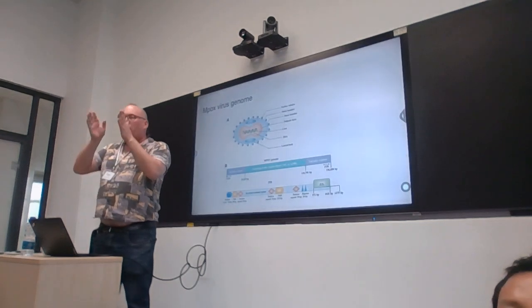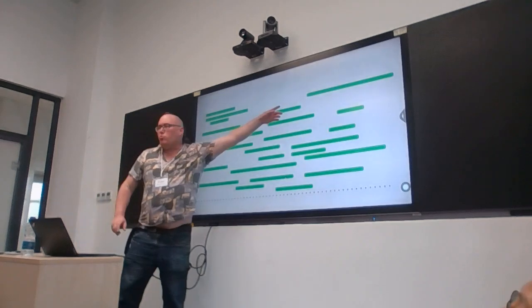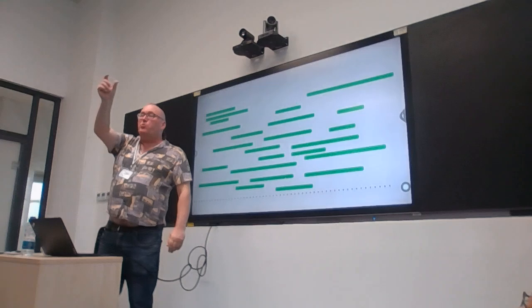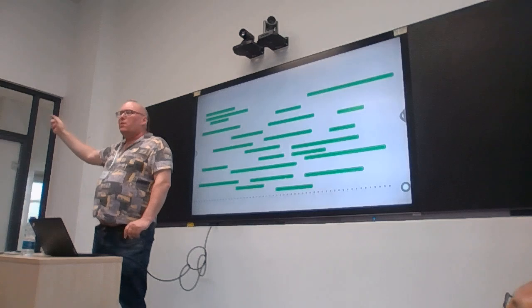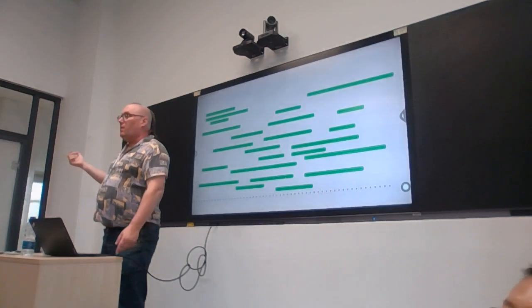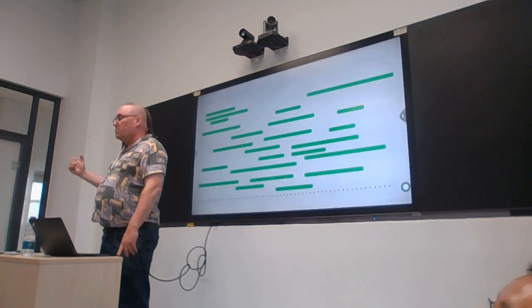So now if you get a fragment, you get your read, it doesn't know whether to put the read with the one copy of the repetitive DNA or the other copy of the repetitive DNA. So that means that in the regions where there's repetitive DNA, we can't trust our results.